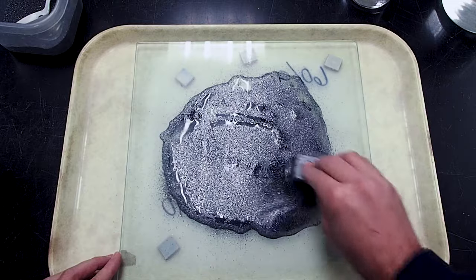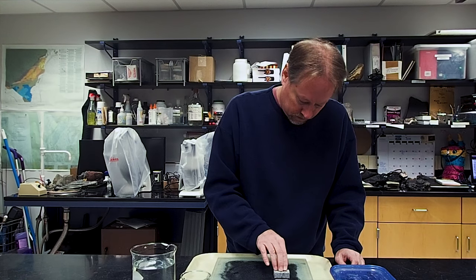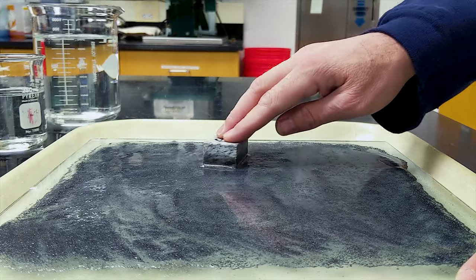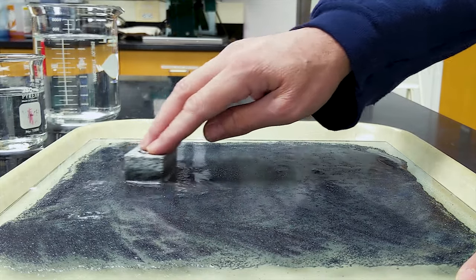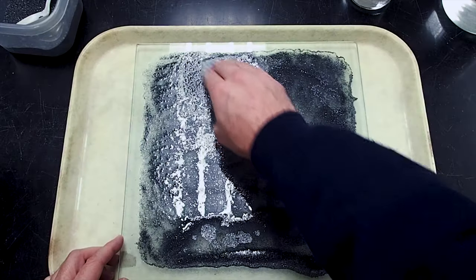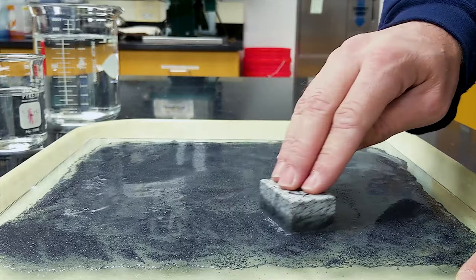At first, you may be working in a small portion of the glass plate, but as you continue to mix the water and grit, you'll eventually want to work the sample all the way around the plate in order to maintain a relatively even surface across the plate. Do your best to maintain even pressure on your sample, but do not press down too hard. Rather, focus on pushing the sample gently across the surface, moving in small circles around the plate.